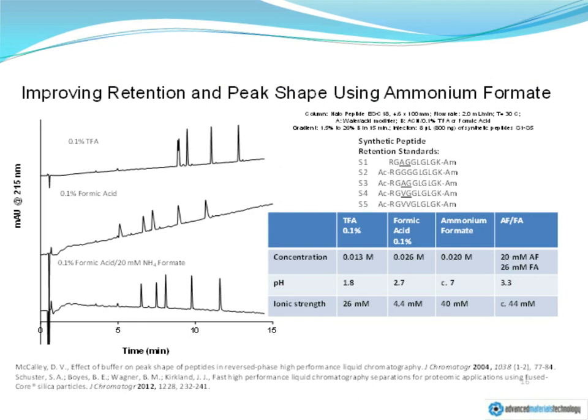And the thinking here was that, in all cases, all proteins and certainly many peptides have basic amino acid side chain groups, and that operation at low pH could have considerable disadvantage with respect to interaction with sites on the stationary phase material, but also at reasonable loading conditions. High loads of such analytes could cause ion-ion repulsion, leading to a loss of chromatographic efficiency.